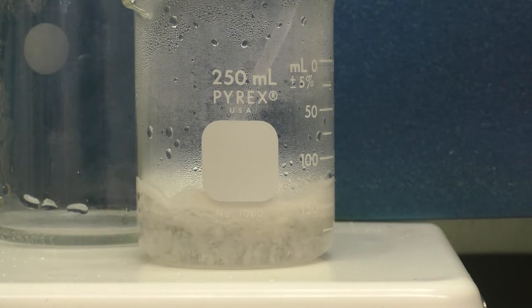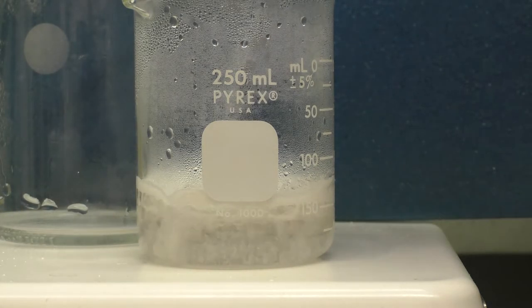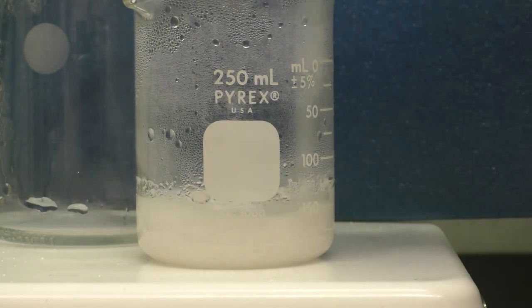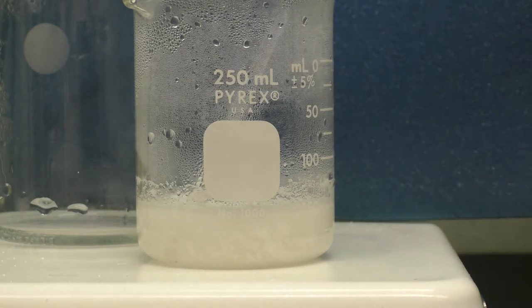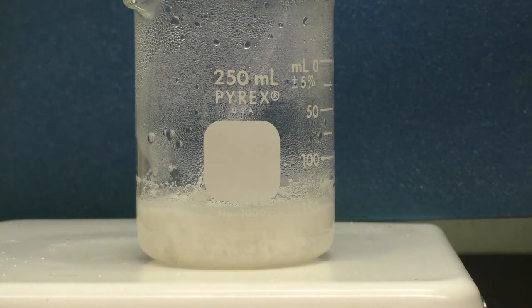Note that will cool the system down when we do. We'll have to then let it heat back up again. But here we can see, as we're boiling quite vigorously, a lot of material is dissolving, but certainly not everything. We have to worry a little bit about losing some volume. At this point, I think it would probably be appropriate to add the remaining water from the initial beaker.